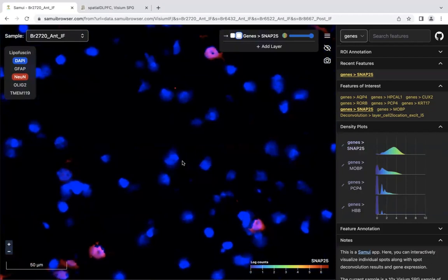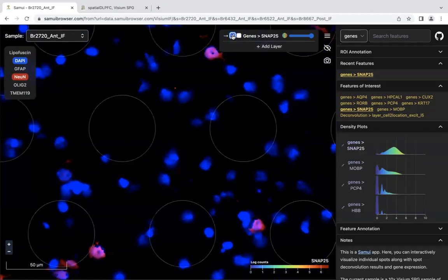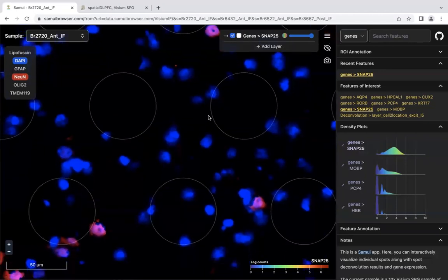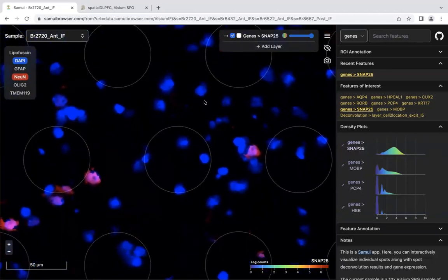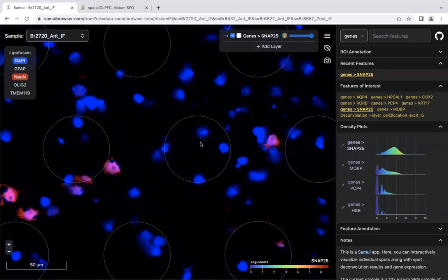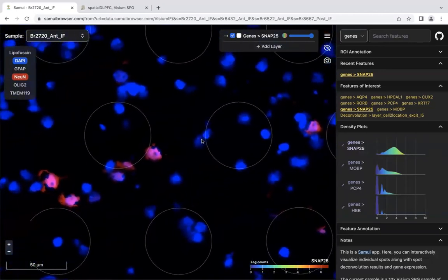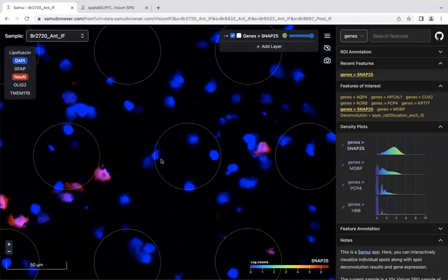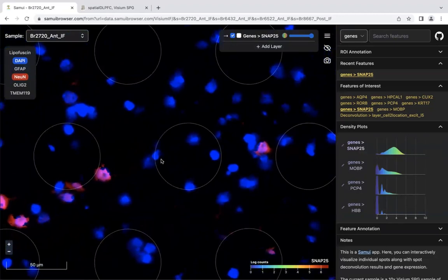DAPI marks for the nuclei, so we can actually look at individual cells. We can see the outline of the spots at their actual scale, so we can actually count cells, for example.